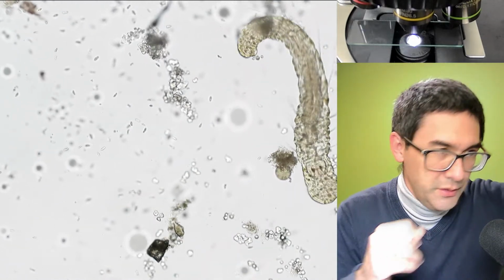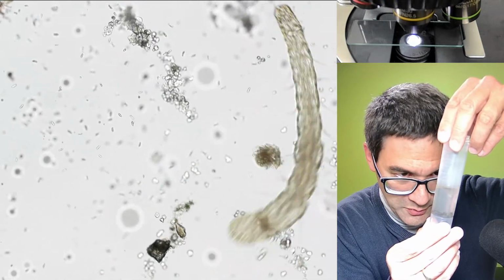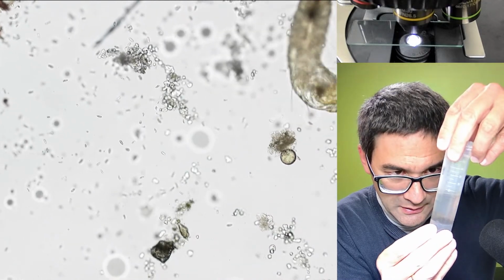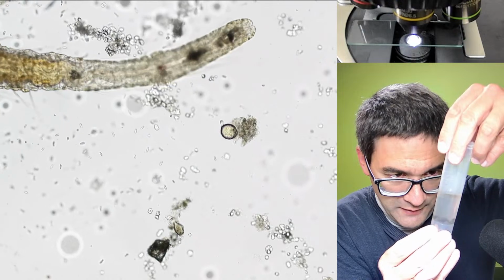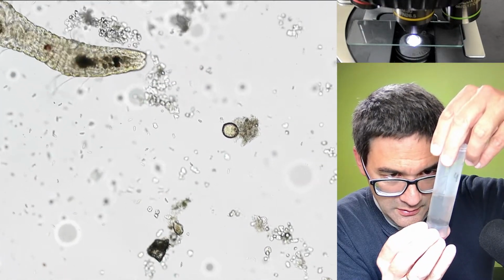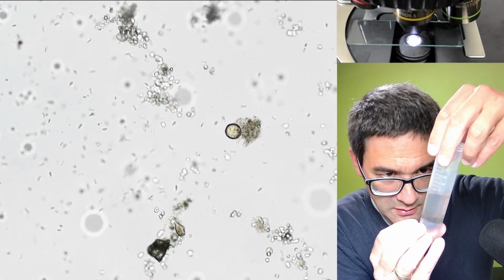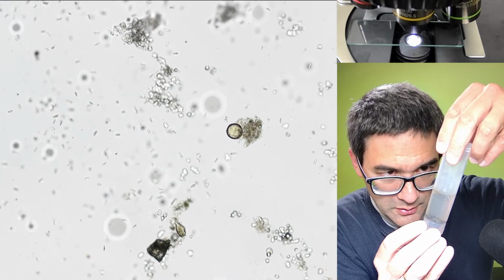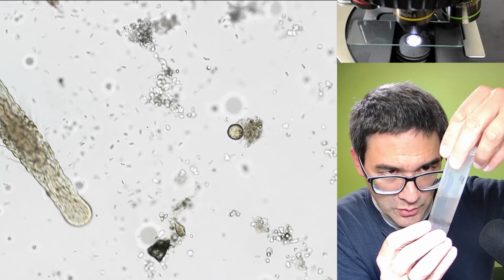Let me see this one over here. I've never seen so many Aeolosoma worms before as in this one. I think they have reproduced quite rapidly. So apparently they have quite favorable conditions here. Yeah, but otherwise I don't see, maybe a couple of water fleas here. But they're all the same type of worm. So maybe another ostracod, an occasional one.